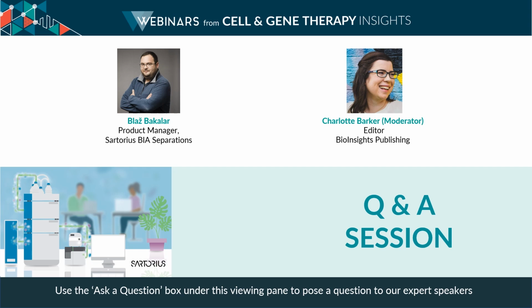Wonderful. Yes, that was a great question. Another question here. What is the frequency of data collection for continuous IVT reaction monitoring? So it's limited by the method itself, and the method takes 8 minutes. So the lowest you can bring it to is 8 minutes. I think we usually do 15-minute time points, though. Usually that suffices to get the relevant information. Brilliant, thank you.